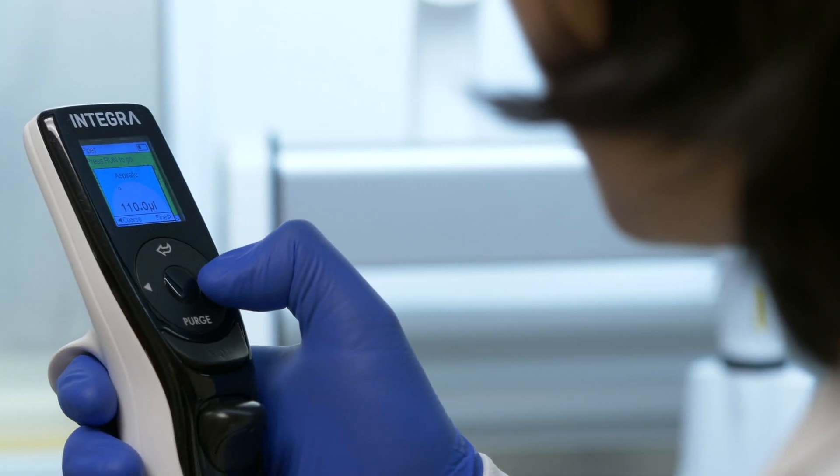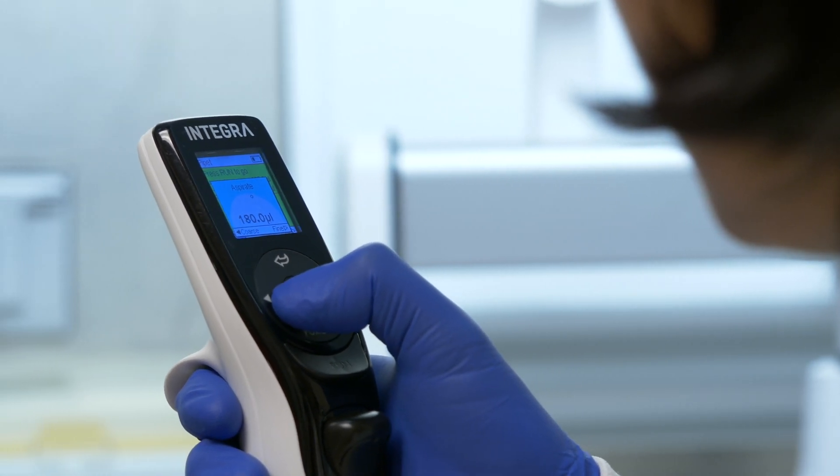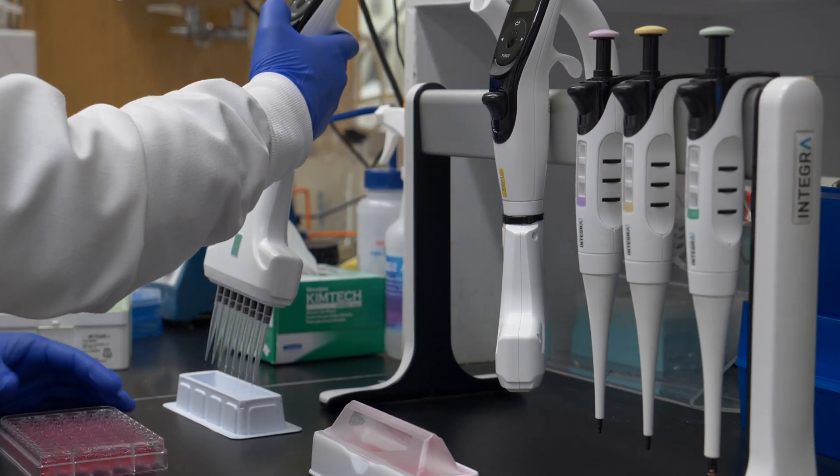It's also very easy to adjust. There's a little dial on the front that you can use to adjust the volume you need to pipette very quickly, and you can also store the settings. That enables you, if you're doing the same thing next time, to just go back to that particular application and punch that in.